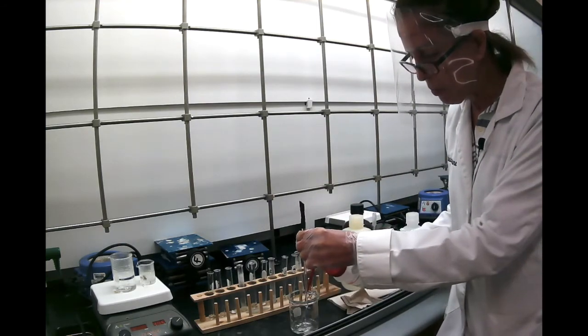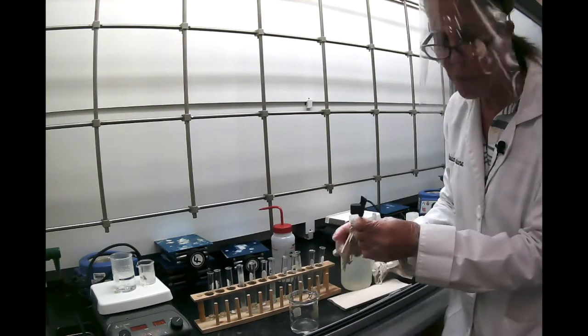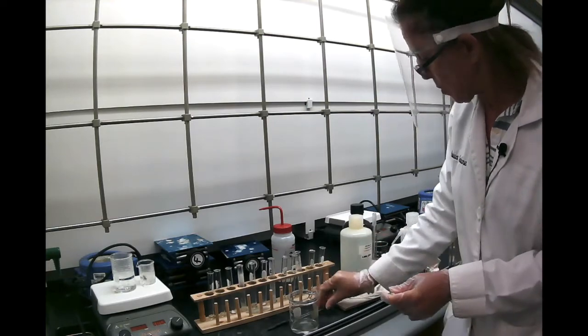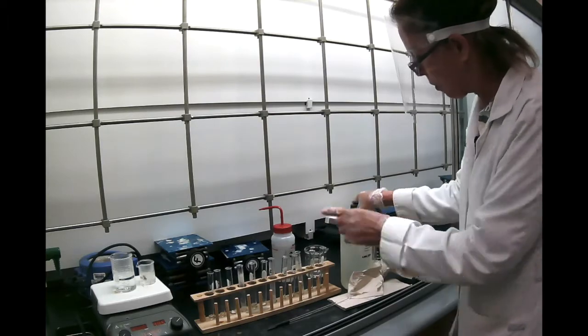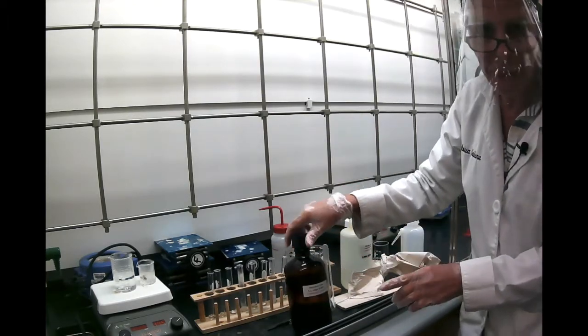The last solvent we're going to do is petroleum ether. So we try to dissolve each of these substances in petroleum ether. Just like we did with ethanol and water, we're going to add 1 milliliter of petroleum ether in each.